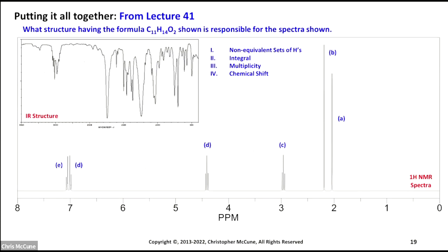Okay, and so I'm going to come back from lecture 41 now. What structure having the formula C11H14O2 shown below is responsible for the spectrum shown? As I mentioned, I would come back to this at the very end here. And so here we are.